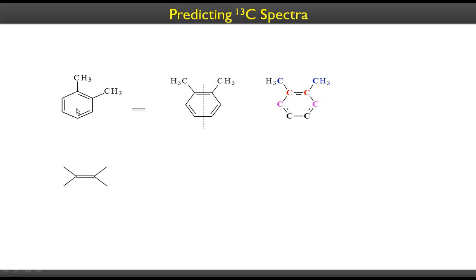It has an element of symmetry along this axis, as you can see here, or plane of reflection, whatever you want to call it. Probably learned that in inorganic chemistry. So that simplifies the number of carbons. So this carbon is same as that carbon is same as that carbon, and I'm pointing with the mouse. This carbon is same as that, and this same as this one. So this part of the molecule is a mirror image of this part of the molecule.